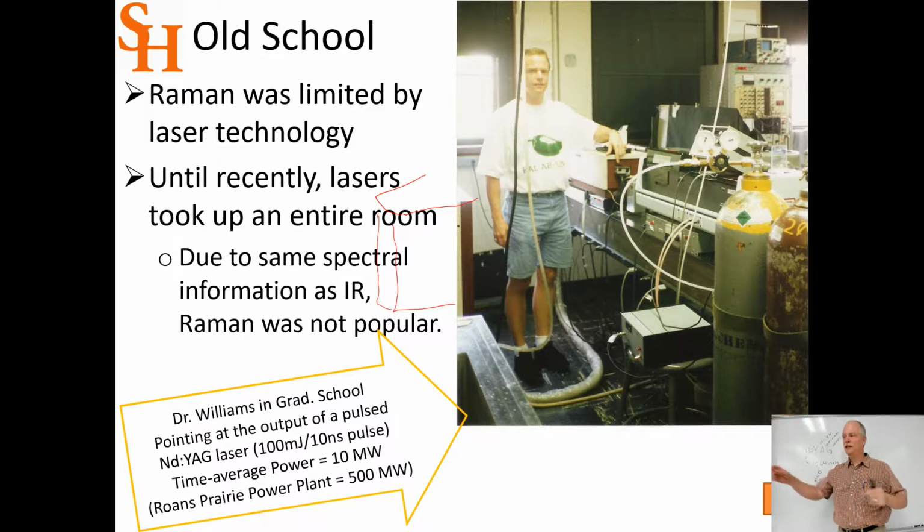And so you could actually time your experiments by sending light back and forth on the table and get all your beams lined up at the same time. And it's pretty cool. A nanosecond of light is about a foot long. So if you had a nanosecond pulse, it would be about a foot long. And you wouldn't see it because it's so fast. I mean, you'd have to use some sort of detector to detect it. Okay. You see it bouncing off the optics.